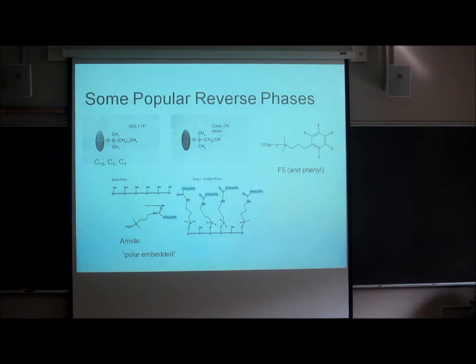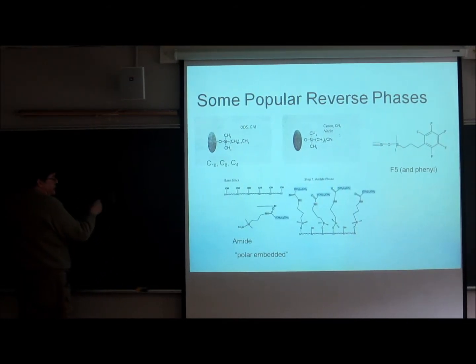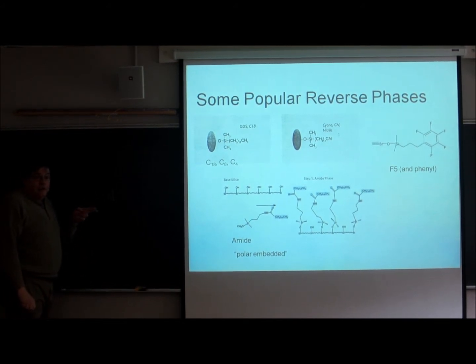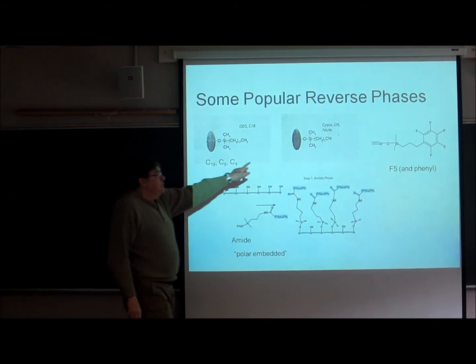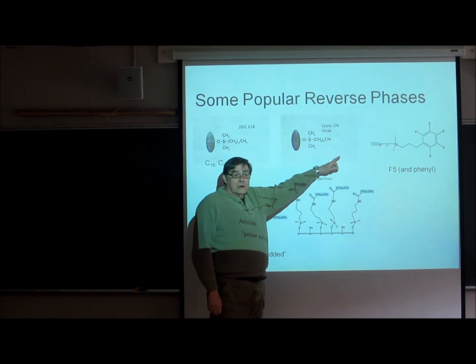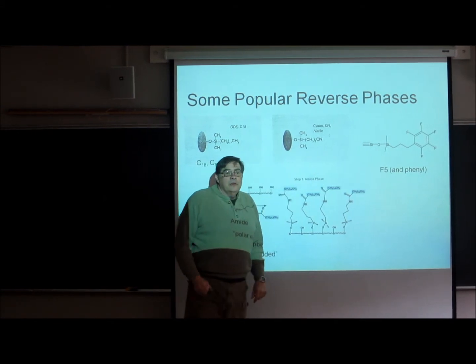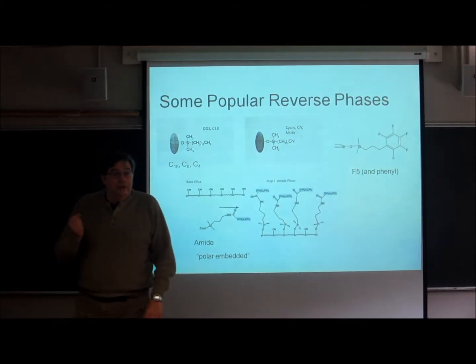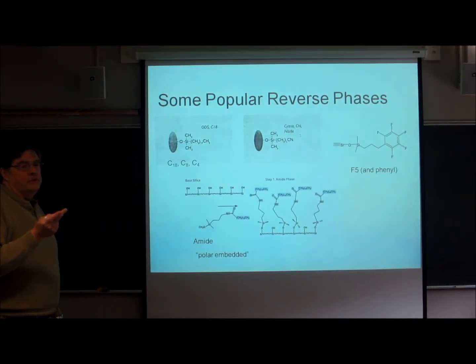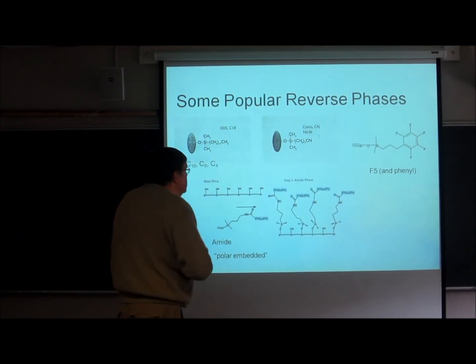And what do we have for electrons? No more extra electrons around here. Lewis theory, there's 8 electrons, but a pair of electrons there. So a pair of electrons sticking out from the stationary phase. So this is going to be a more polar reverse phase column. And this will select toward more polar solutes that move by. It's not an acid-base reaction, but you can have polarization occurring from these electrons. They can polarize other molecules near them.